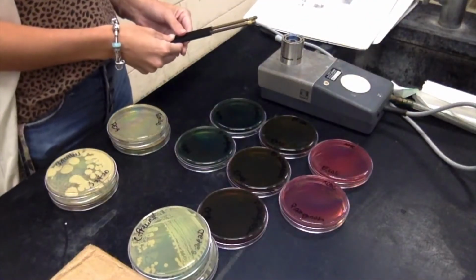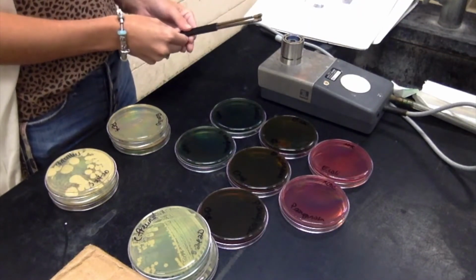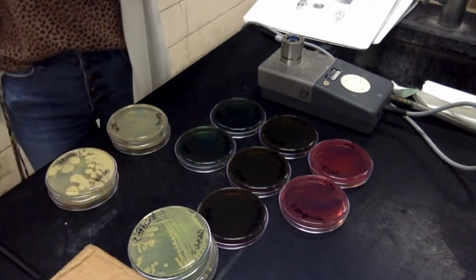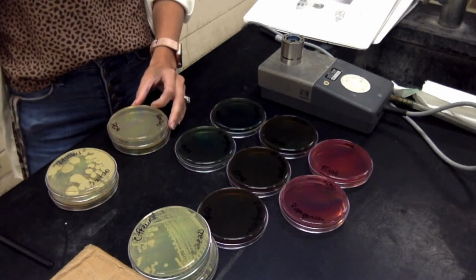All right, so I'm using 2 loops just because it goes by a lot faster whenever you use 2 loops. So I'll flame my loops. And like I said, these are going to be normal streak plates.